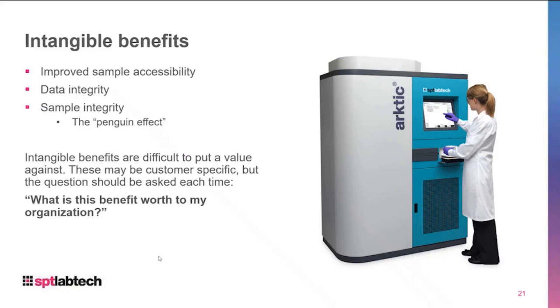And if it's not well collated or collected, we can have a lot of trouble downstream in all industries and in all areas of the business. And then the one I'll talk a little bit more about next slide is sample integrity. Again, you have to believe that your sample in the freezer is going to stay viable for the longest potential amount of time, and you want to be able to trust that once the sample's in there, you get the most value out of it.